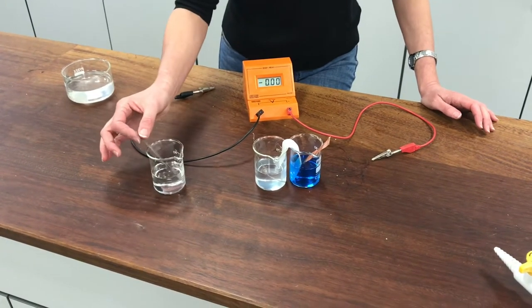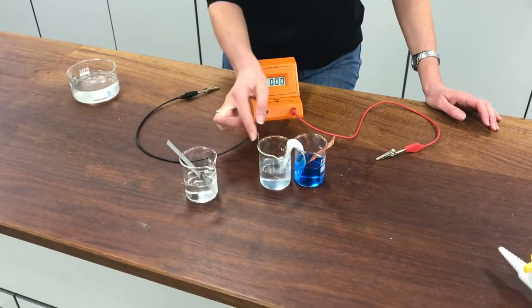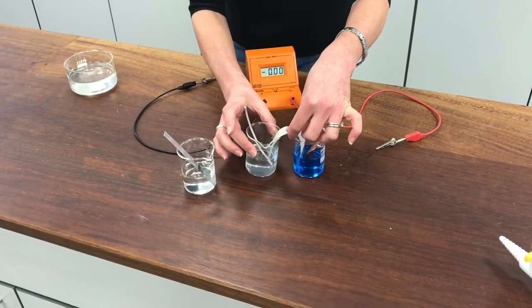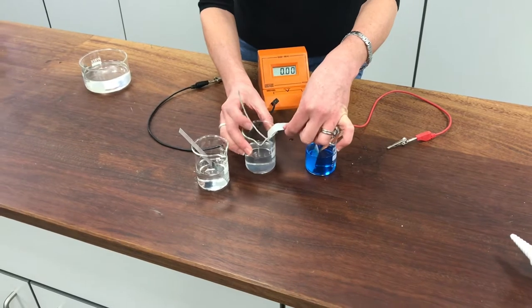I'm now going to repeat the experiment using a zinc half cell rather than the magnesium half cell. Now I probably ought to put a new salt bridge in there, but I'm going to be lazy and cheeky and try and get away without doing that.